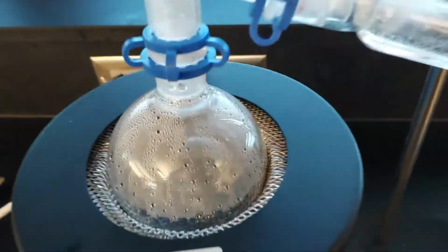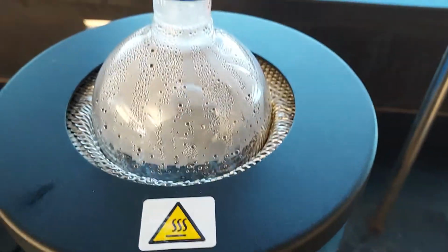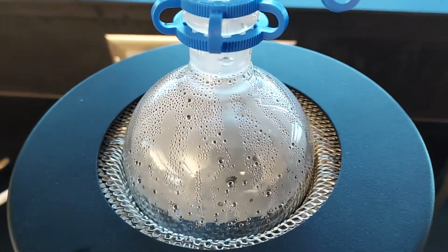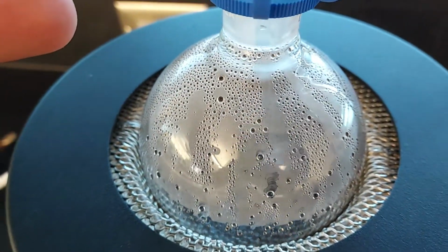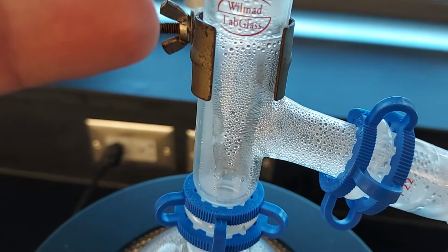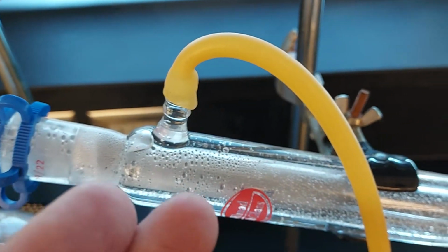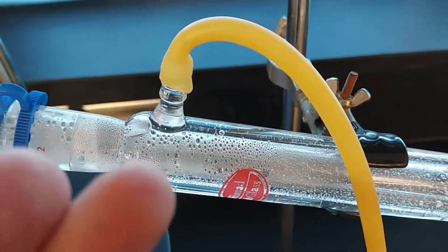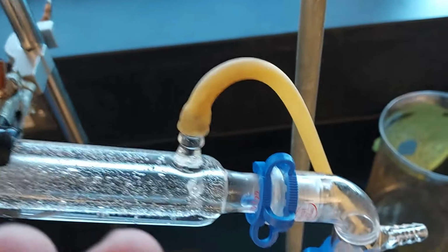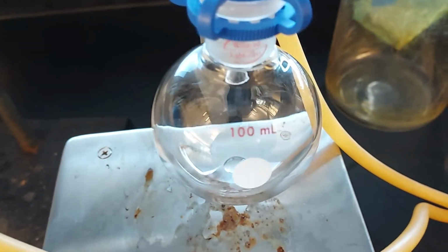All right, so we can see here we have some fairly vigorous bubbling, which means we've got some liquid converting into the vapor phase. You can see some of that is condensing here at the top of this round bottom flask, but much of that vapor is making it up into this condenser head and then coming down this condenser tube. You can see the vapor liquefying, and these drops will eventually collect right here. Oh, we got the first one there in that receiving flask.